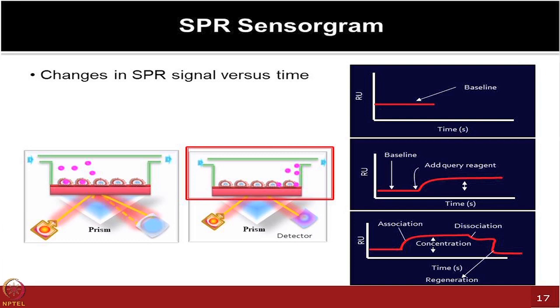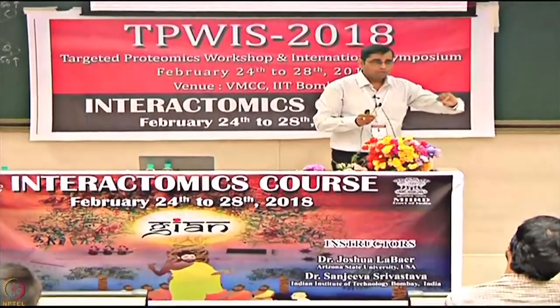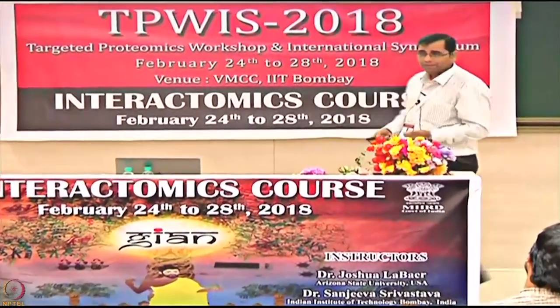And then you will see the off rate going in. Now, you are doing these experiments on noble metals, which are very costly, essentially gold. So you want to regenerate and reuse the same slide again and again, at least a couple of times. You use some mild acids to chop off the binding molecules without disturbing your printed molecules.